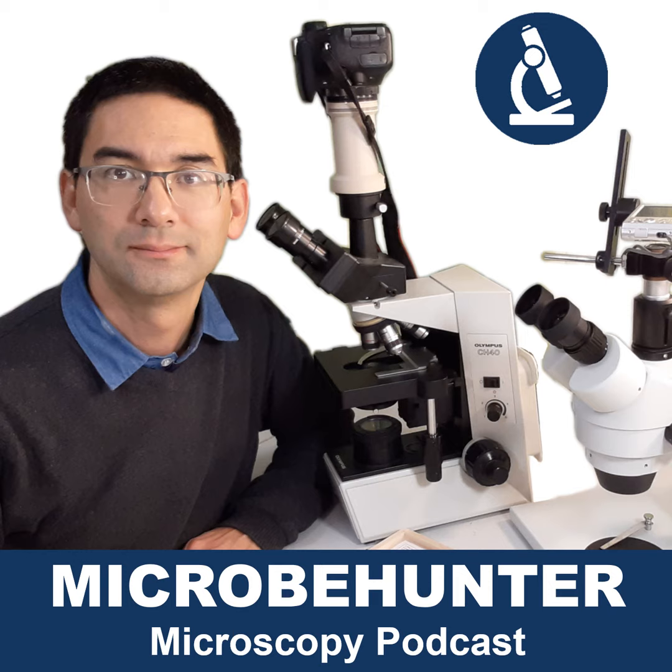But still, you are asking how do you prepare a slide for this, and are there any books showing the different stages of development? If you just type life cycle of certain parasites into Google search, in picture search, you find tons of pictures about the life cycles of different parasites, and you can see that many of them are quite different from each other.